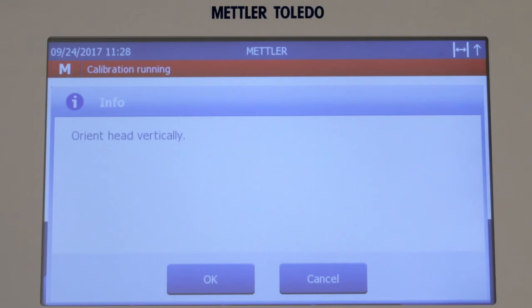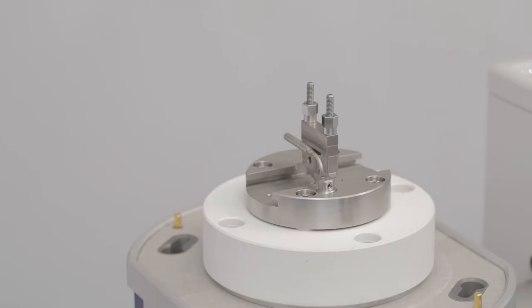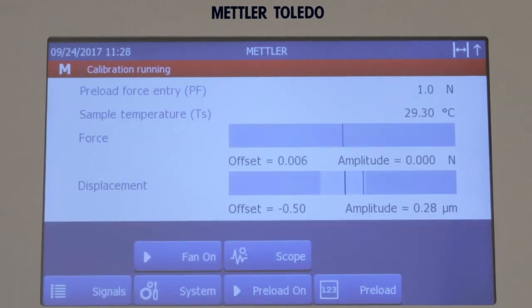Tap OK to confirm the vertical orientation of the DMA measuring head. Tap OK to confirm that the driveshaft is free from any obstruction. The initial force calibration without the weight is performed.